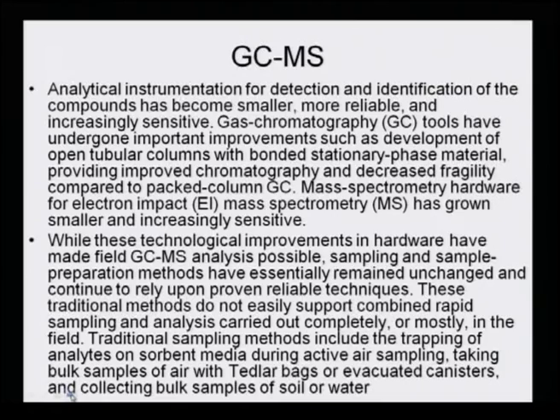Mass spectrometry hardware for electron impact, that is the mass spectrometry method which includes electron impact, has become more and more sensitive and increasingly important.